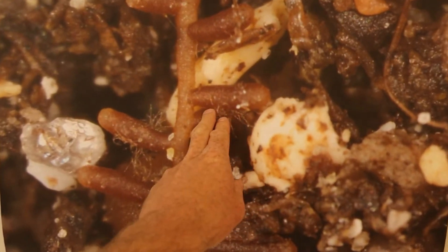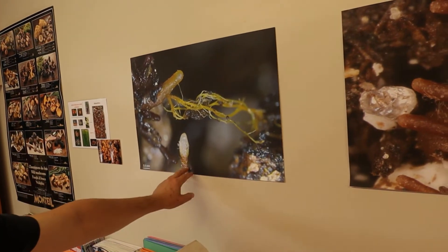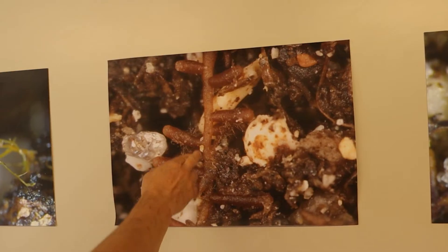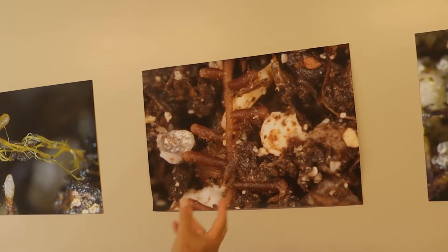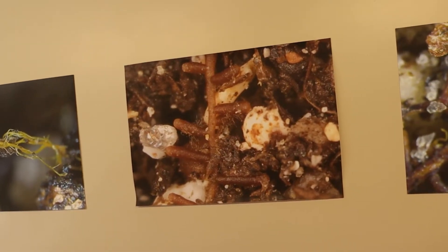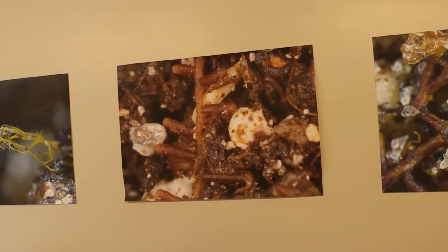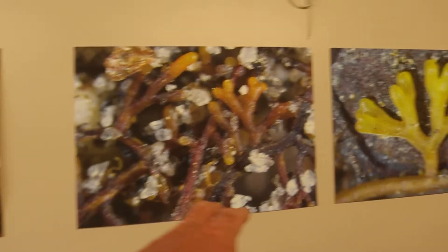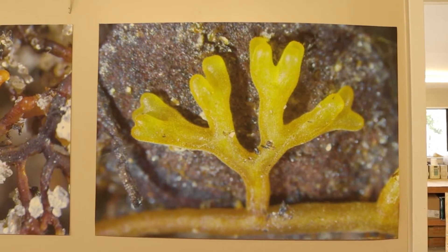Those are the clubbed roots — they are swollen. This is a non-mycorrhizae root; you can see root hairs, there's no mantle here. That's pine. This one is hazel. You can see the central root is non-mycorrhizae, but all these little lateral ones are mycorrhizae — they are clubbed and thick. And that's what's on the wall up here, like a saffron milk cap mycorrhizae. They are fleshy and orange.